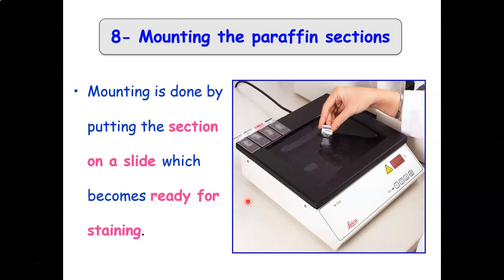This is my question. Ready to be examined by the microscope, or should it be stained? Yes, it should be stained. So the section here is ready to be stained by stains of histology, as we will discuss later.